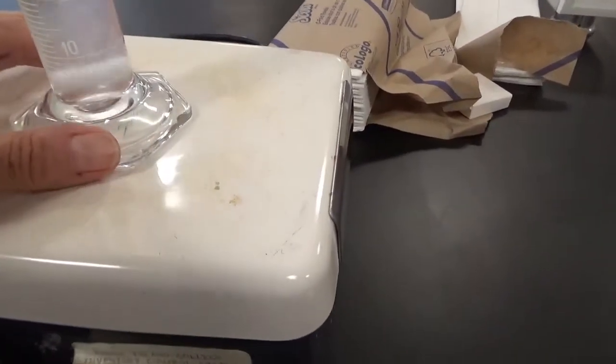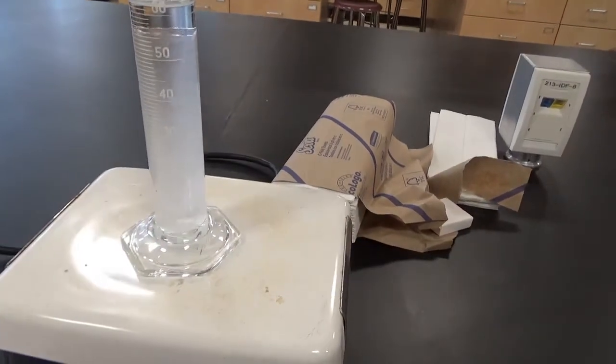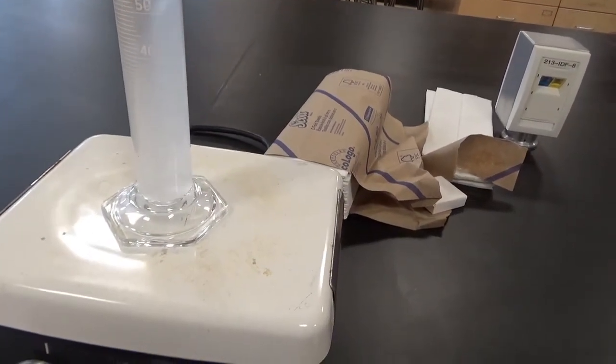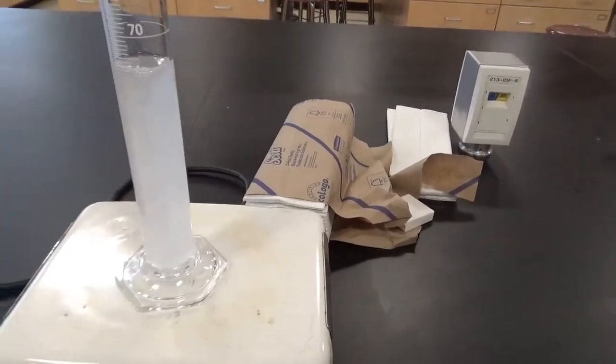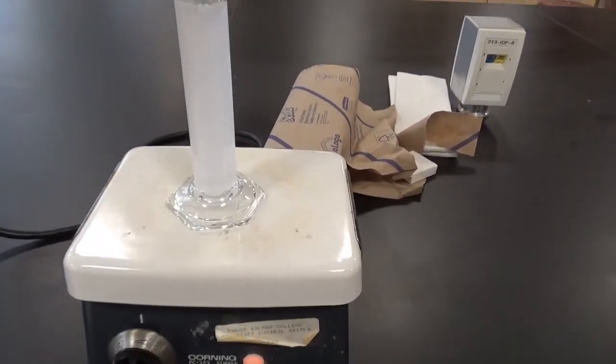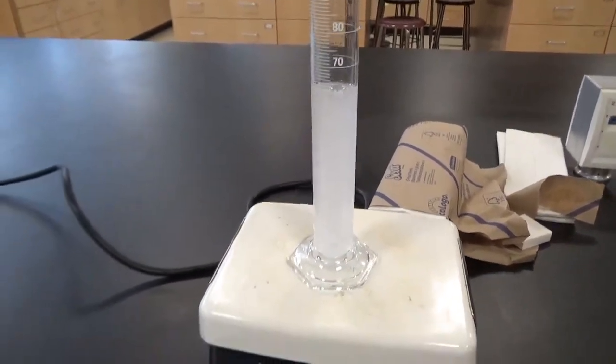Making a lot of noise. And it does seem to be cloudy all the way through. So what I'm going to do is just let this mix for like 10 minutes, and we'll come back after and take our final readings.